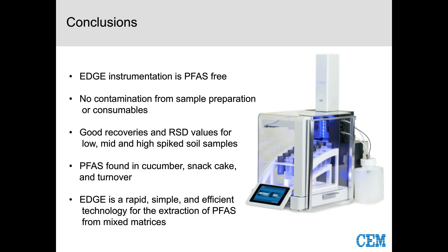I want to expand upon that just a little bit right now. To go back to the beginning of the talk, the current talk primarily is water. That's where our EPA methods are for drinking water, and it's where most of the work has been done to date, on water samples. I don't want to completely exclude water as a possibility to run on the EDGE. Now, the EPA methods are for 250 milliliters of water. 250 milliliters is outside the scope of what we could run on the EDGE.